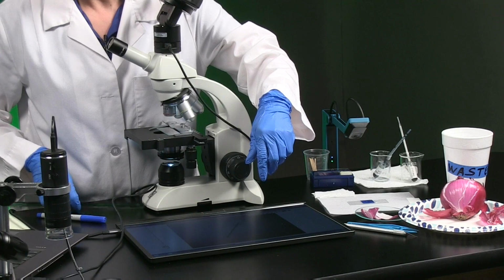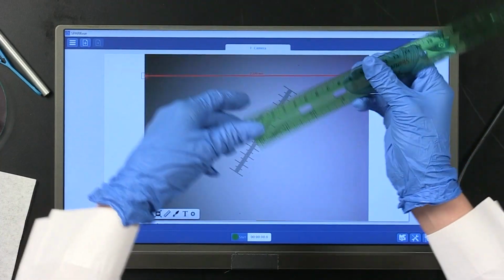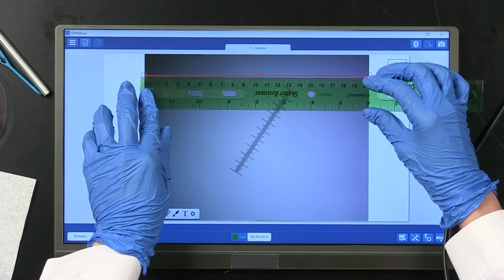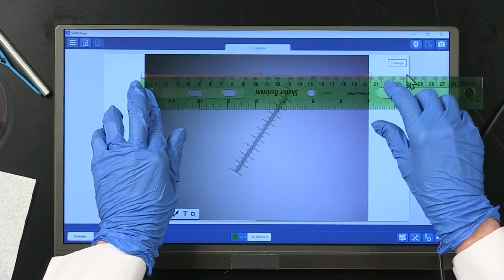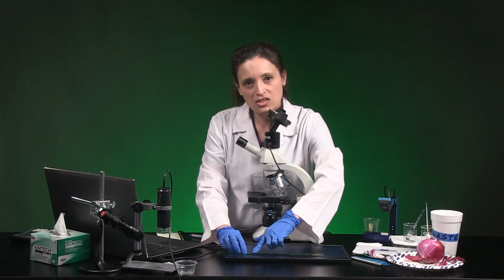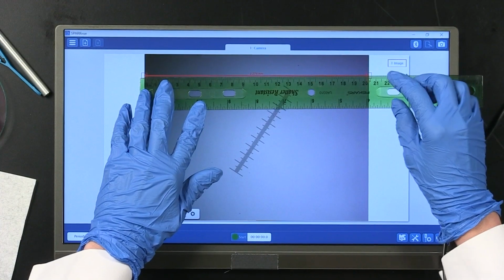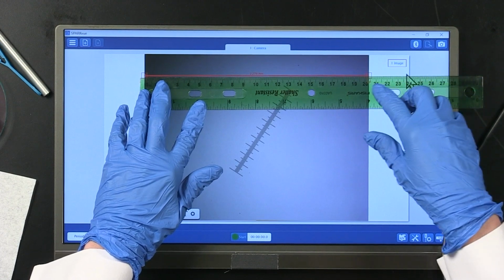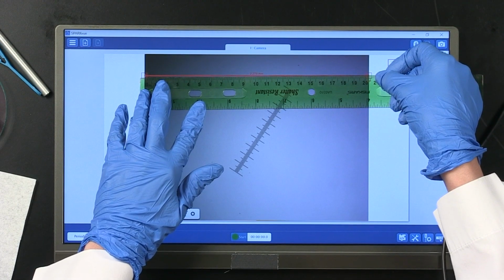So I'm going to grab the ruler, and I need to use metric and remind myself that this is actually centimeters. Oh, I should probably look at the precision of this ruler. I'm working in millimeters, right? So I see only 1 millimeter lines.